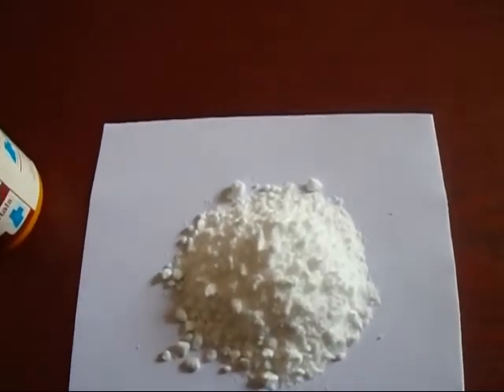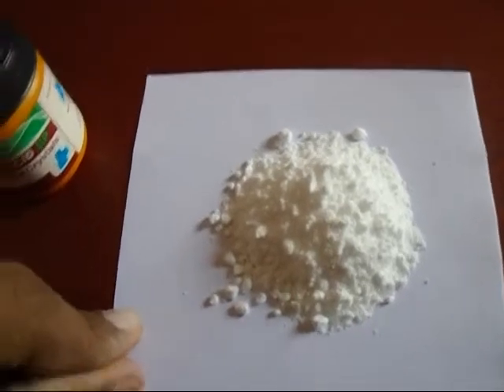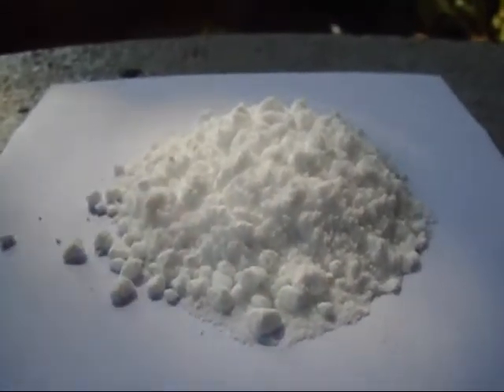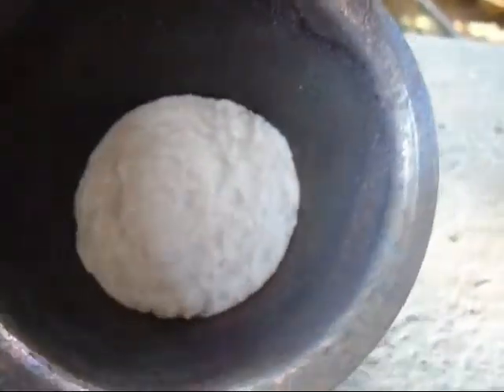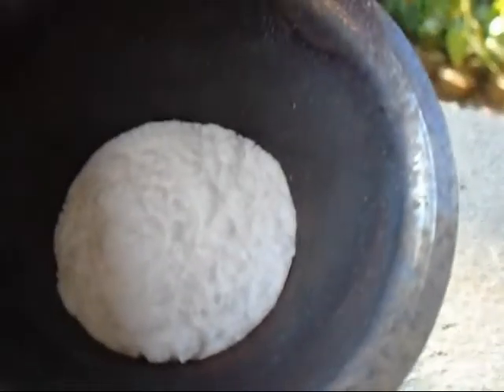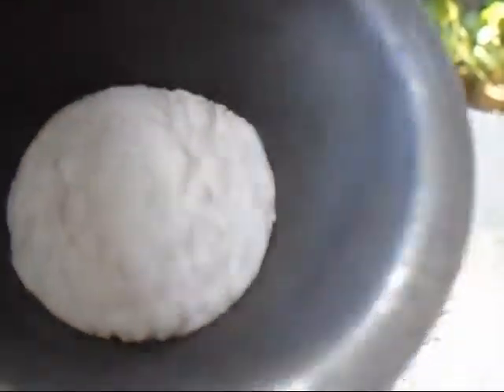First, we need to decompose this boric acid into boric oxide. Now you can see I have 5 grams of boric acid here. I put this boric acid into a metal container and now I am going to heat it. You can see the boric acid decompose — water boils off.